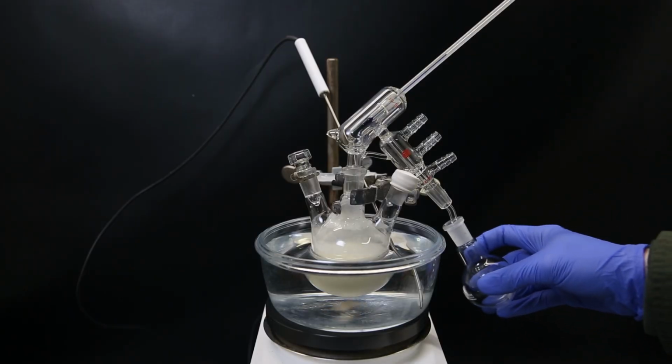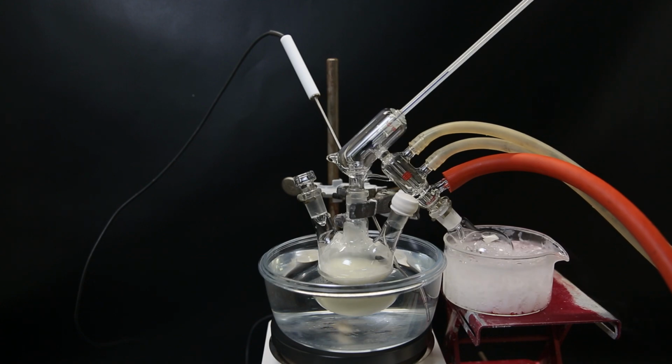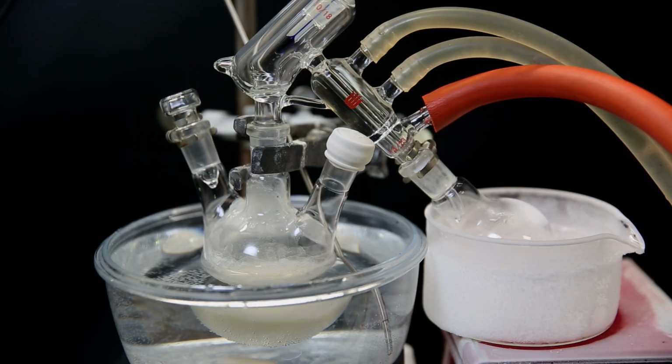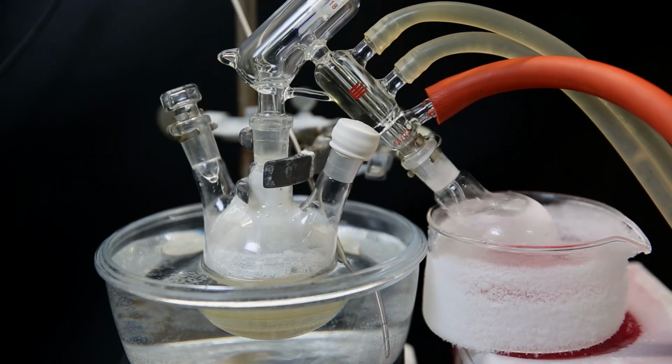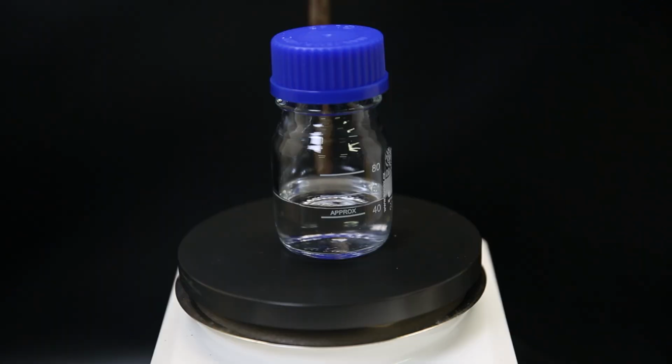When it is done, I set it up for short path vacuum distillation and heat the water bath to 40°C. I also put the dry ice isopropanol bath from before under the receiving flask to prevent losses from evaporation. When it has come to temperature, a liquid starts distilling over, which should be a mixture of mostly diethyl ether and propellane and a tiny bit of pentane. When it stops coming over, only a yellow sludge is left in the distilling flask, which is mostly lithium salts. I transferred all of the distillate to a storage flask, and it should contain some 1,1,1 propellane.